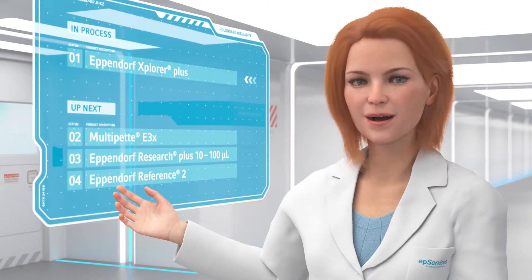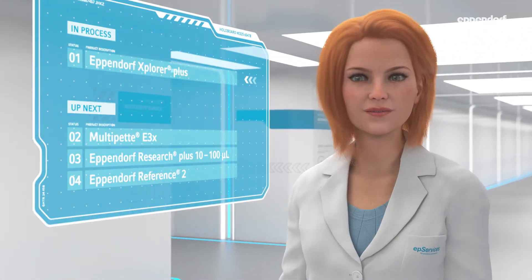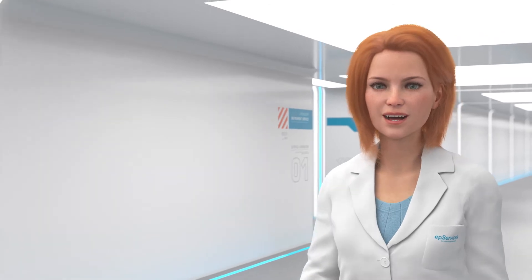I see your pipette is being serviced. Let's watch how Tom is performing the maintenance procedure.